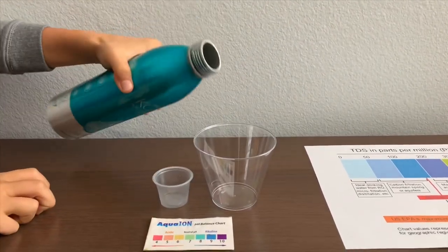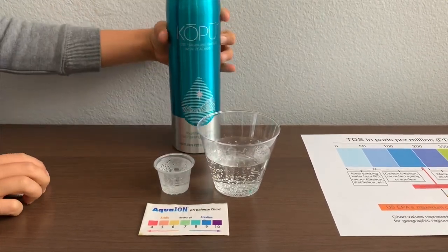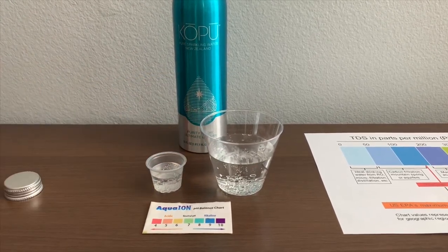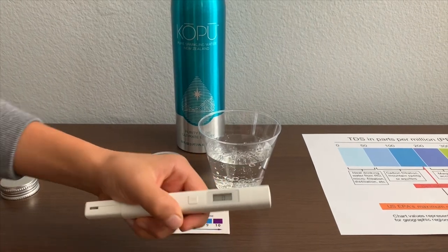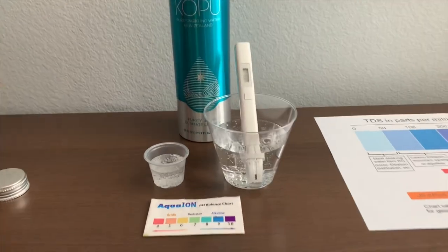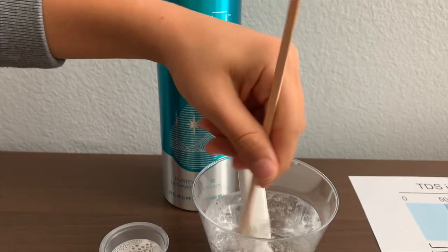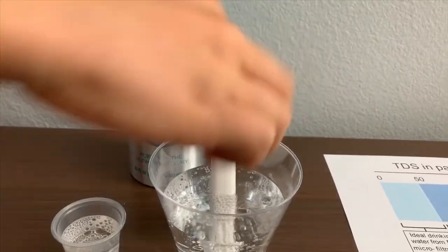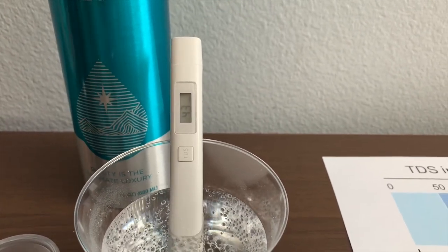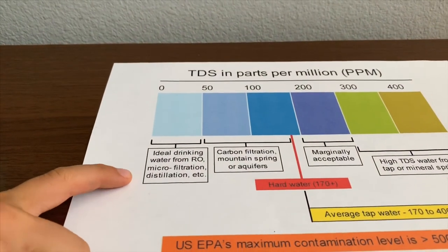Let's pour some water in. This is a little too much for the pH glass, so let's put some back in the TDS. Turn on the TDS tester, make sure it says 0, and put it in. Let's stir it a little for a better result. It's in the tens to the fifties — forties to fifties — so that's ideal drinking water.